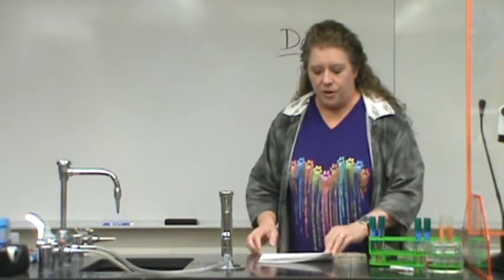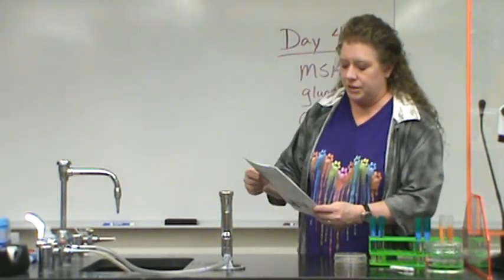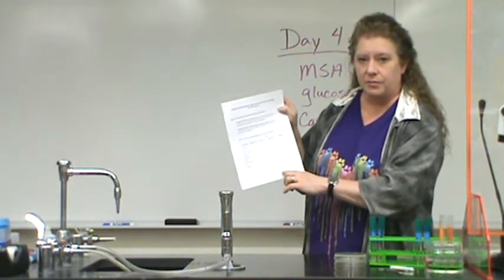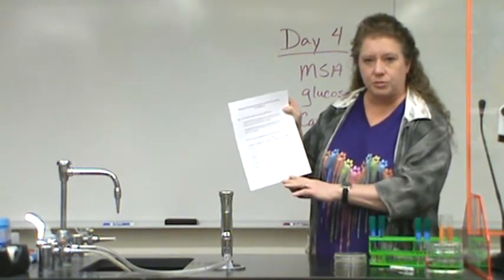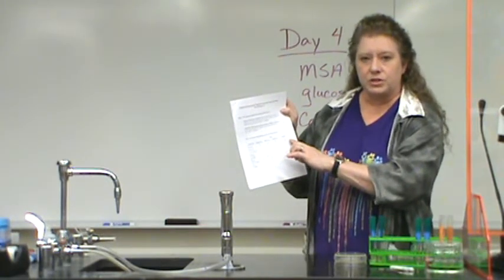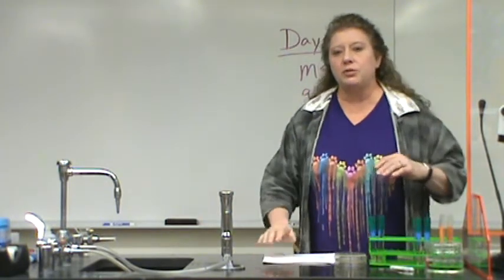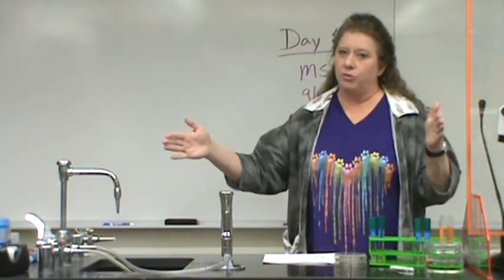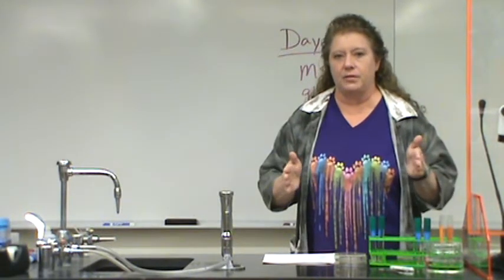Once you get those results, you're going to be able to determine what genera of bacteria. There's a nice table on page 1 that shows you the test results and how you can interpret what genera you have. Remember, genera means the first part of the scientific name. If it's a Staphylococcus aureus, the genera is Staphylococcus. That is what you're determining from these results this week.